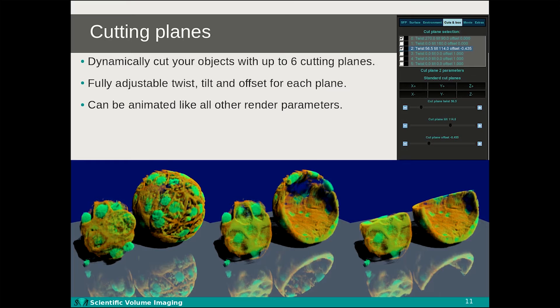Another new feature in Huygens 19.10 is the ability to add cutting planes in the SFP renderer. These will virtually cut away parts of your image, allowing you to look inside. Up to six cutting planes can be added at the same time, each placed in an arbitrary position and orientation. In the example images, a single cutting plane is used with a plane normal pointing roughly towards the camera, and then a second cutting plane is added with a plane normal pointing roughly upwards. By combining cutting planes you can cut wedges, cubes, slices and many more shapes, and by animating these you can make very information-rich animations.